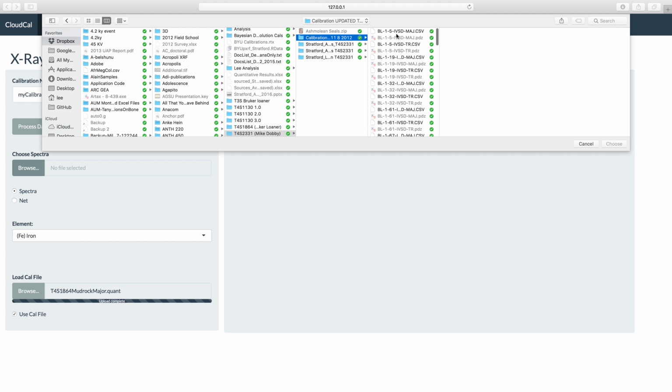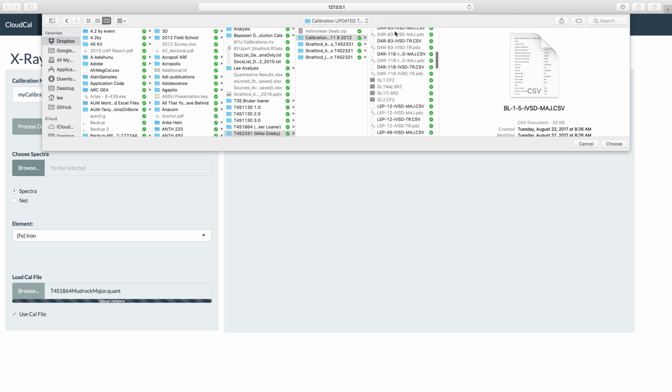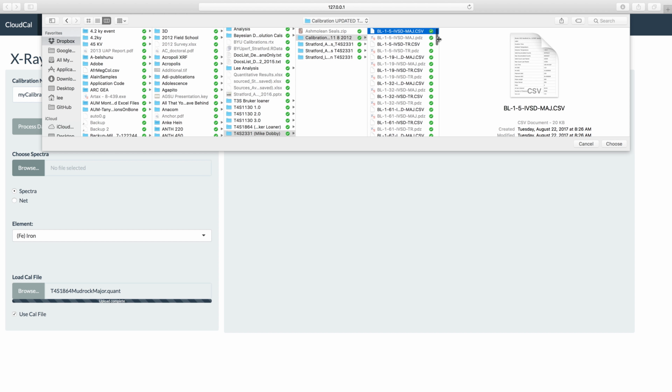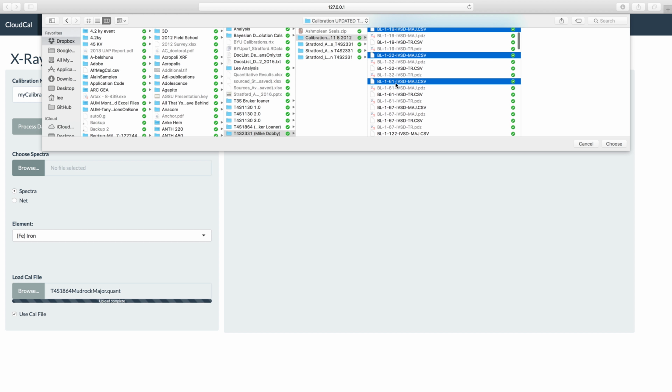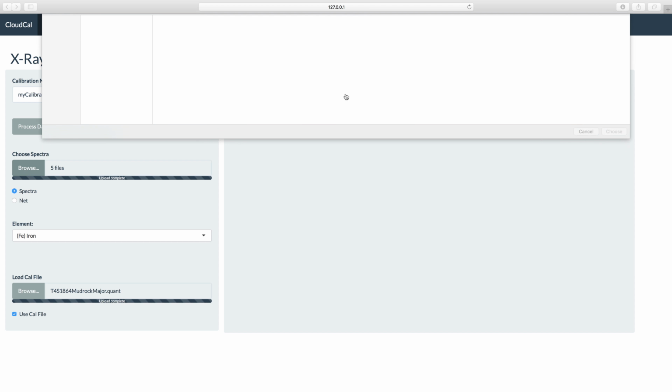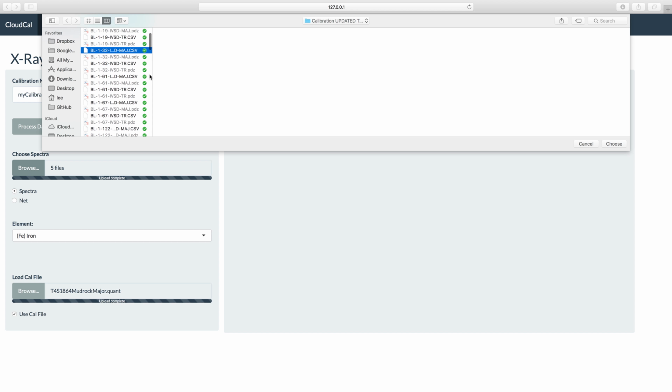So we come over here. We have his standards right here, which unfortunately are not organized near as nicely as the other ones. We're going to come over here and grab them individually. And if you make a mistake, don't worry, you can just come back and reopen them up.